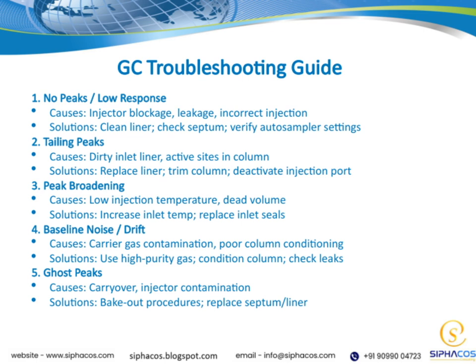Moving on to peak broadening, which can be caused by low injection temperatures or dead volume in the system.